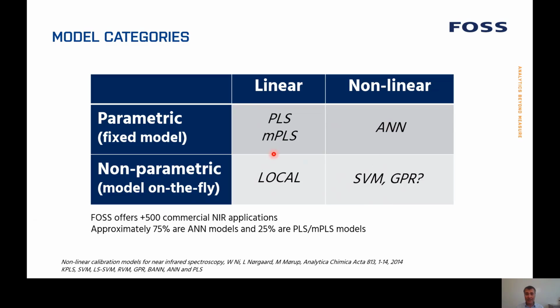The first ones here are based on templates. So if you know the instrument type and you know the product type, a template is implemented, and you can simply go through this using our template and make a model using what we use as the optimal settings for this specific data set for this specific instrument.